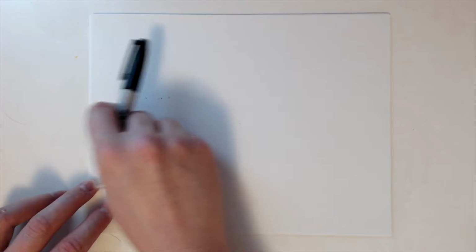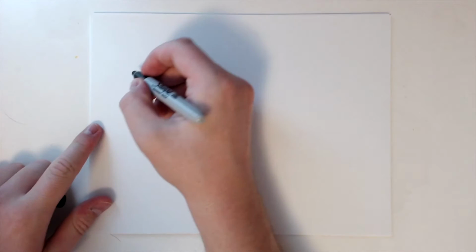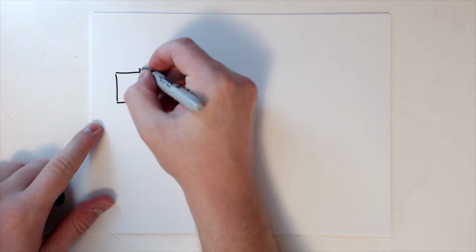All right, so let's talk about the grinding process, not just the size of the papers. So grinding can occur by hand. So I have basically what looks like a piece of sandpaper, and I apply my sample to it that's mounted, right? So I manually move it across the sandpaper. There's also belts, so basically a long strip, and then I can basically rub my sample across it in a linear direction. There's also machines, and with those machines, you typically have a motor.